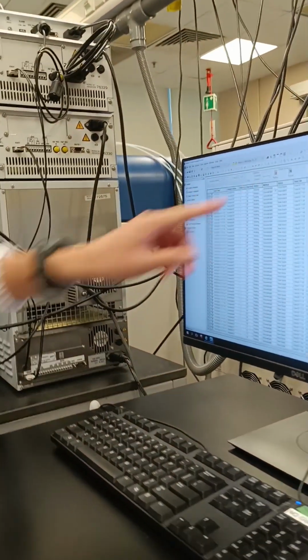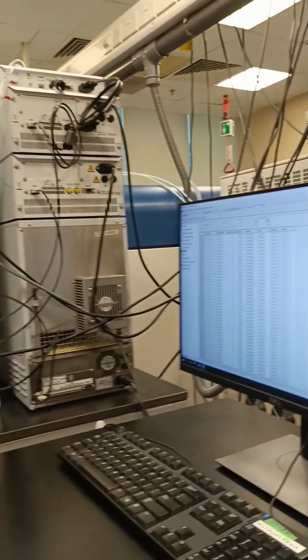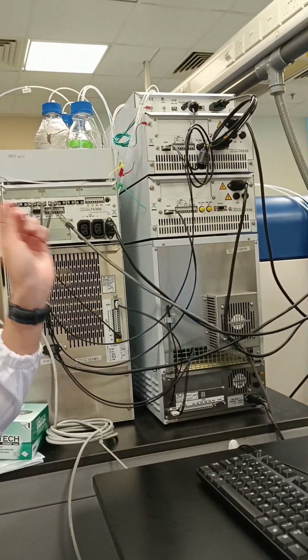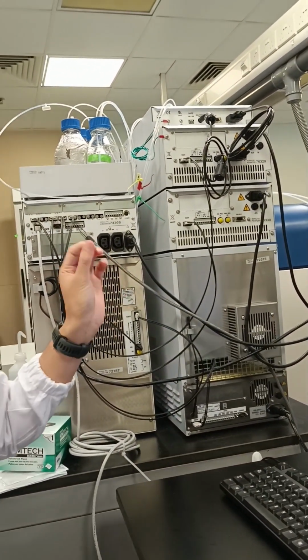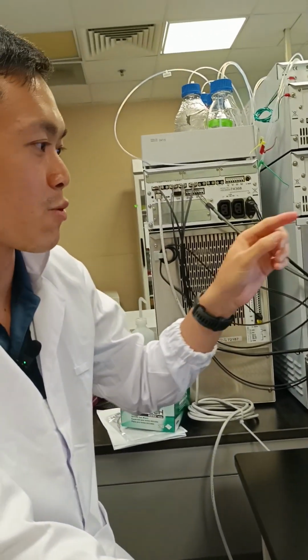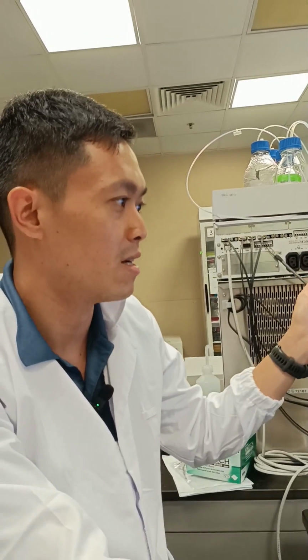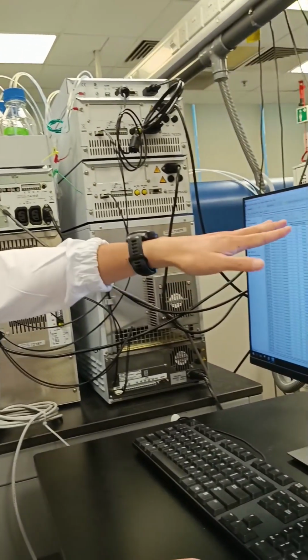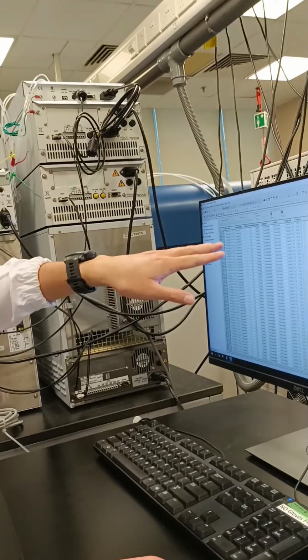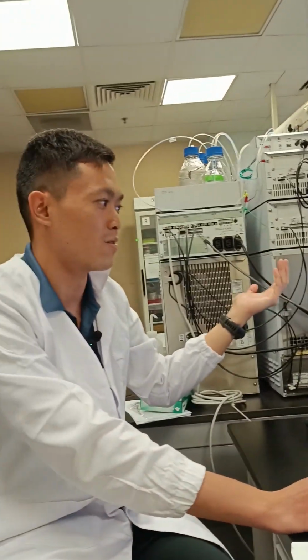And then we go into pre-run. Usually I make sure I pay attention to the sound, like if there's any movement of the needles, then I will only leave the lab. Because there was one time I never waited until everything started, because it was still within this pre-run range. I just left the lab, and when I came back on Monday, everything was not done.